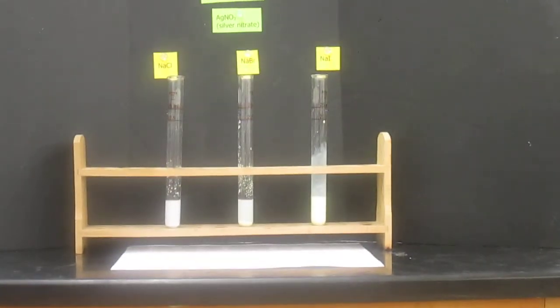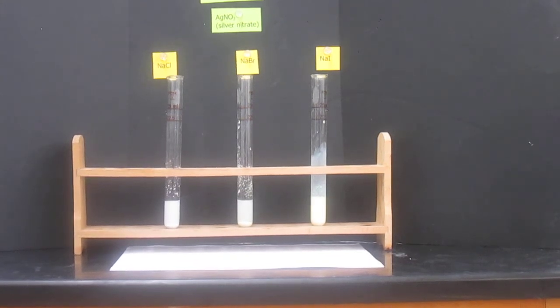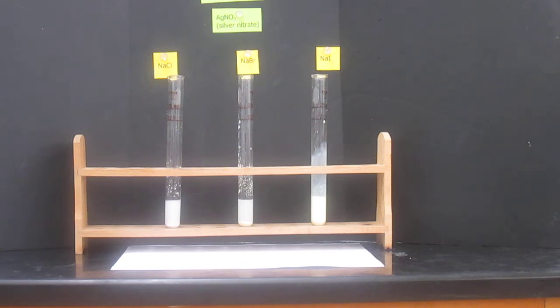So these are our 3 silver salts. Color and approximate quantity of precipitate. You can see each of those and fill out the approximate quantity in those. Then we have the solubility in the ammonium solution. So I'm going to start adding ammonium hydroxide to each of the test tubes.